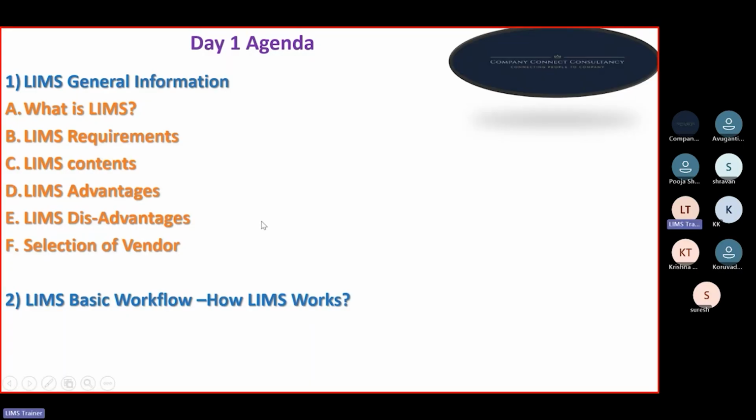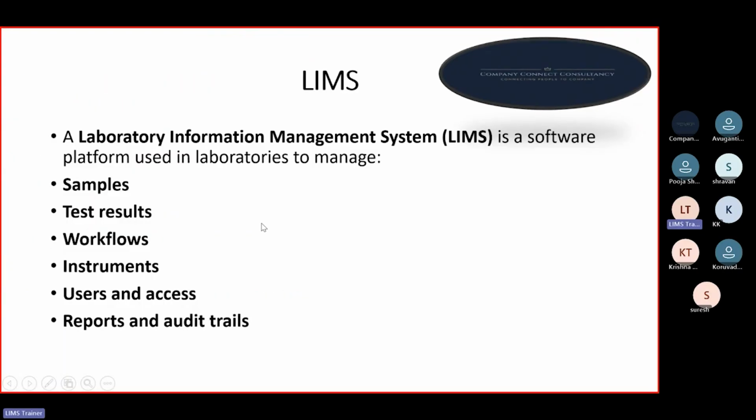Okay. So let's start. What is LIMS? A laboratory information management system is a software platform used in laboratories to manage samples, test results, workflows, instruments, users and access, reports and audit trails.